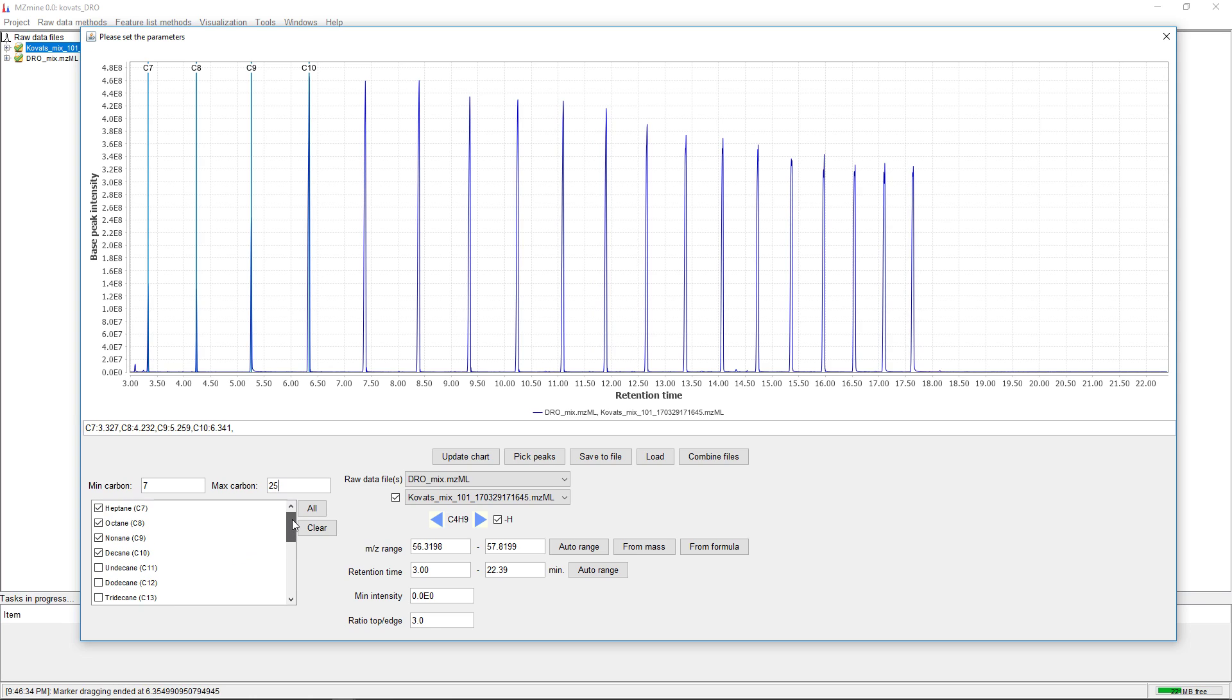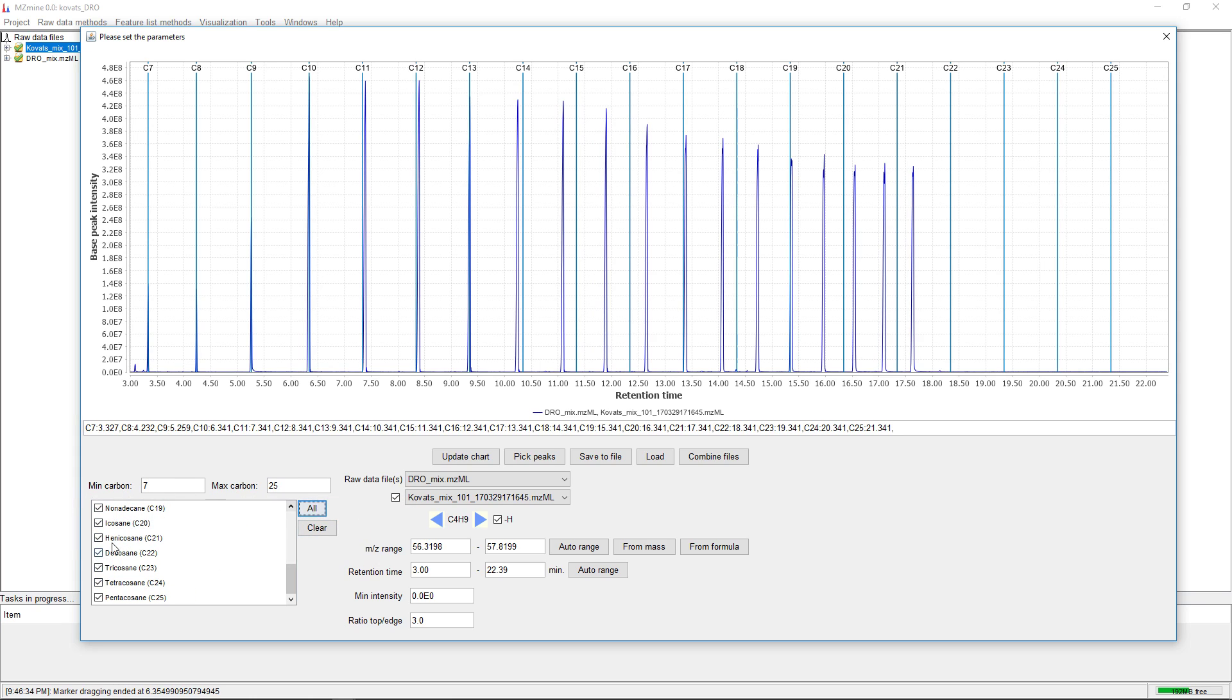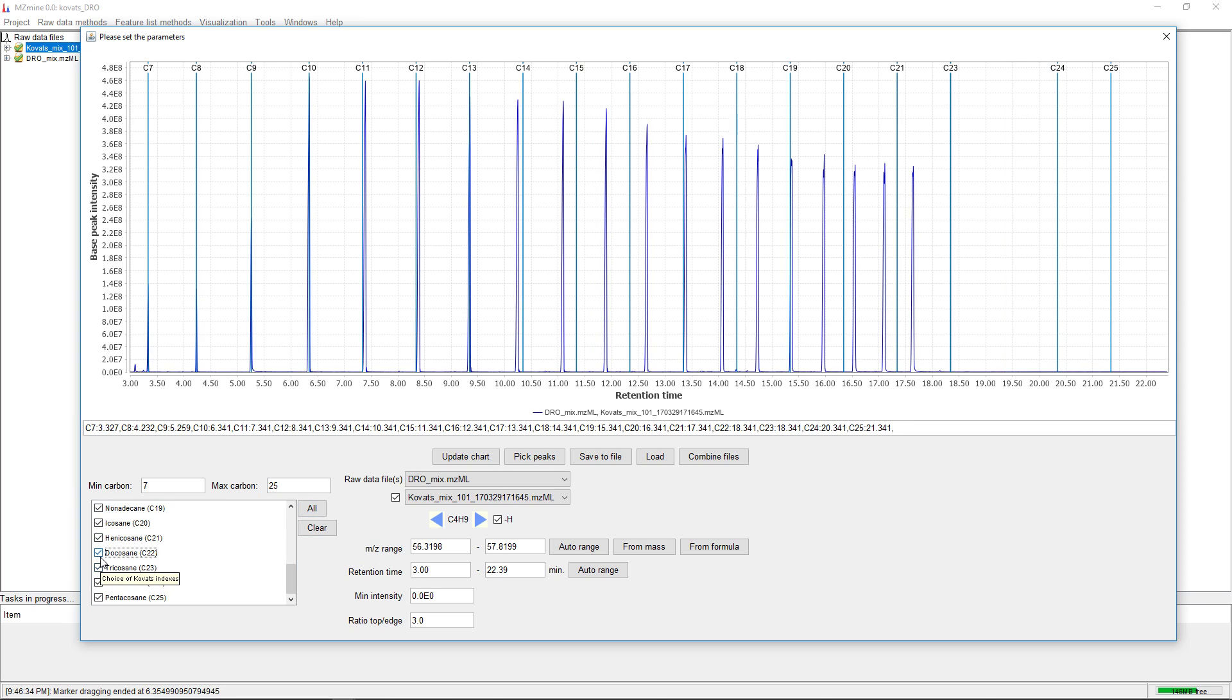The list is going to change. By typing it in, we get this range. We don't have to use all of them, but we can add all and take some out if we don't see the standards or don't want to use them.